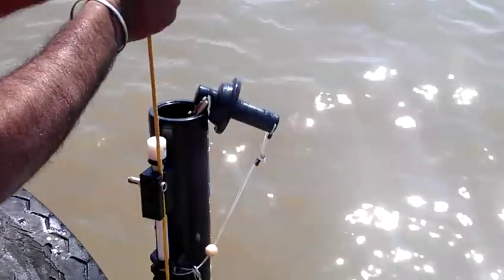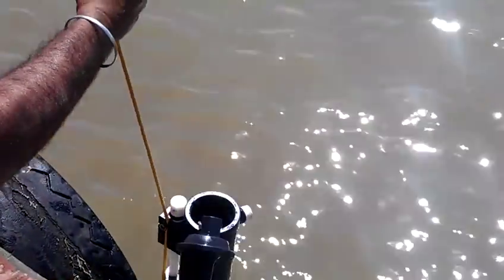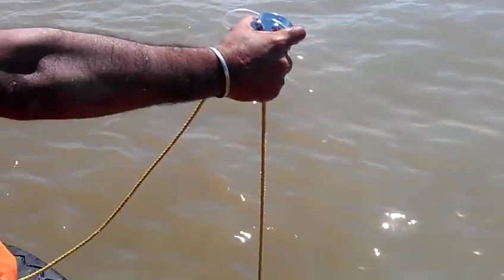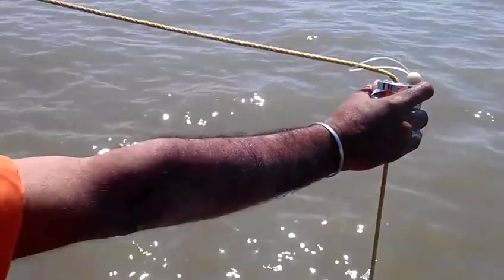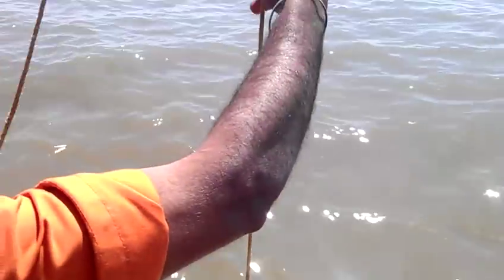Then you have to lower to the required depth, holding the messenger in your hand, and lower the water sampler. Now this is 5 meters lowered. Once it is lowered to the required depth, you have to send the messenger like this.